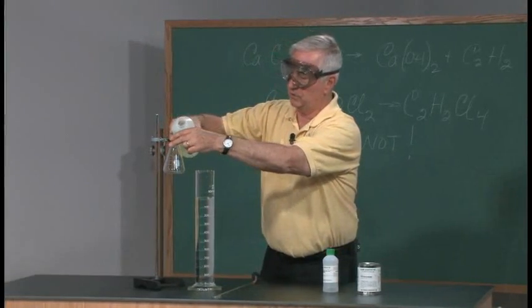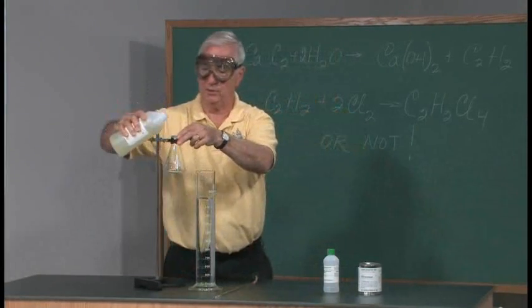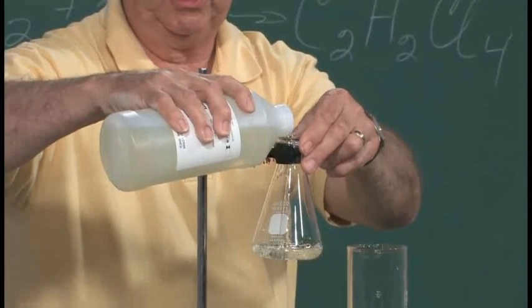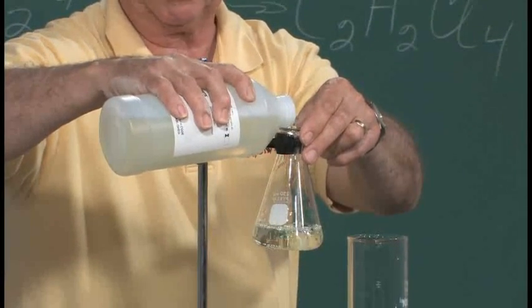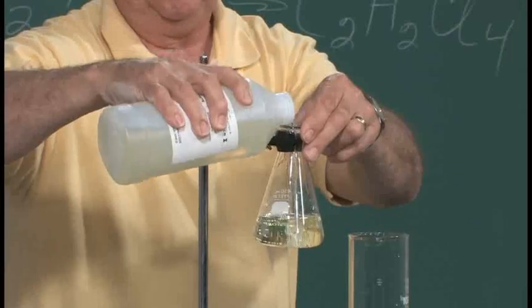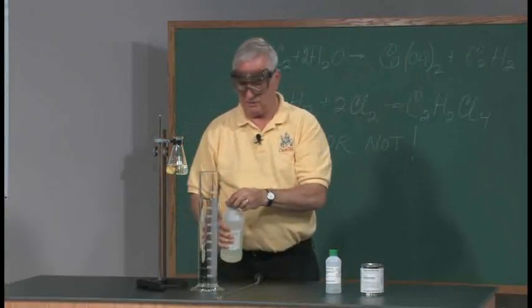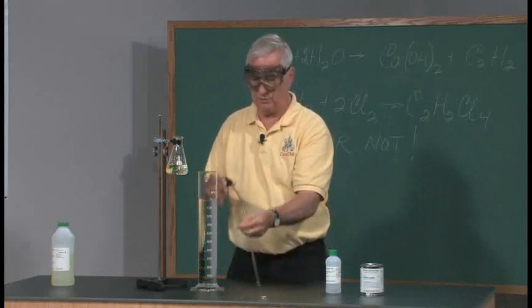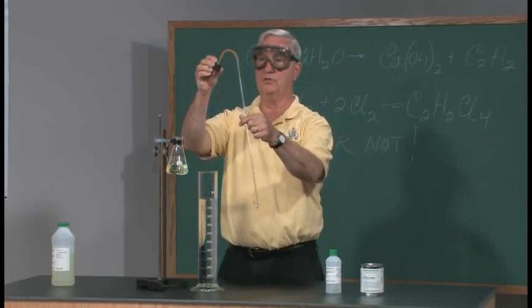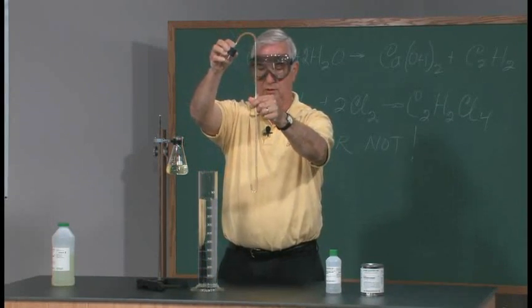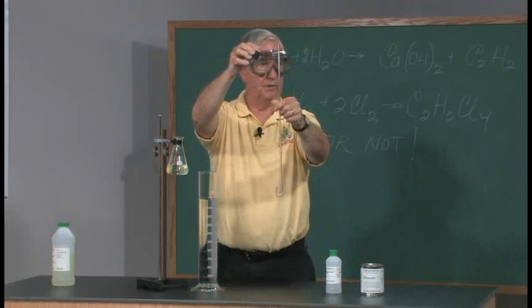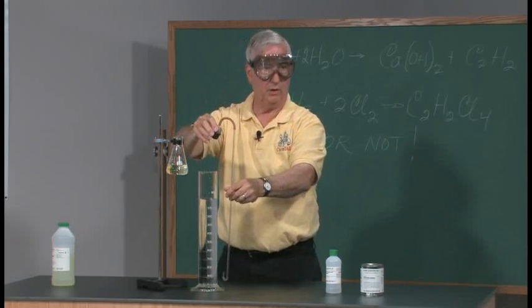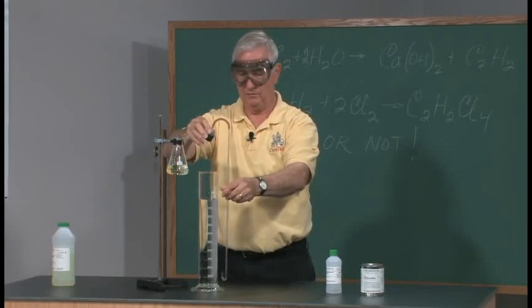What I'm going to do is introduce approximately 100 milliliters of household bleach into the reaction flask. The reaction flask is fitted with a rubber stopper delivery system which delivers the gas to a long tube that is J shaped so that the chlorine gas can be released below the surface at the bottom of the cylinder of water.